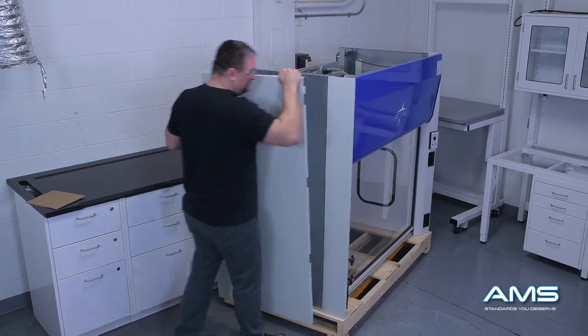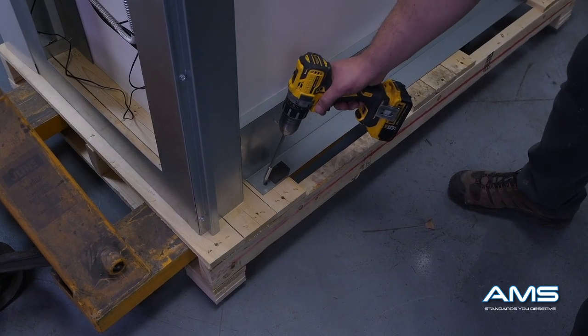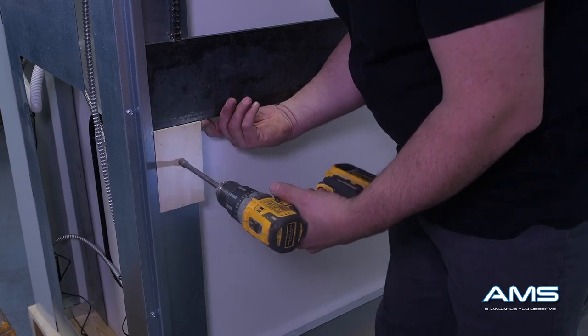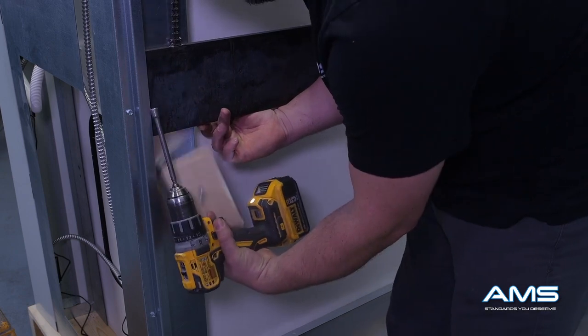Remove the anchor screws from the sides of the fume hood as well as from the back edge of the fume hood. These are holding the fume hood down to the crate and can be removed with just a Phillips screwdriver. Next, remove the wood blocks that are holding the sash weights in place for transport. Repeat this step on the opposite side of the hood.